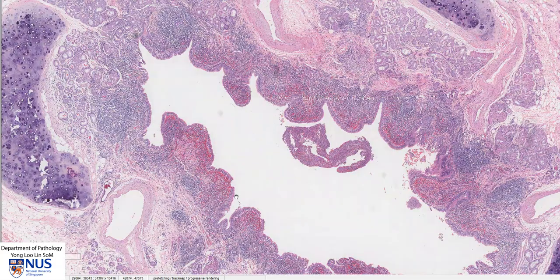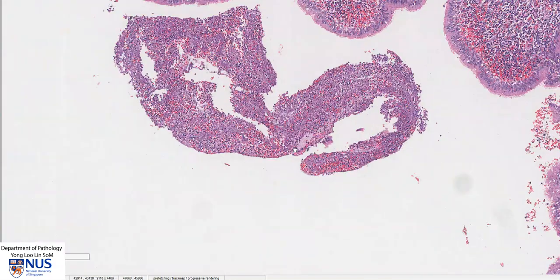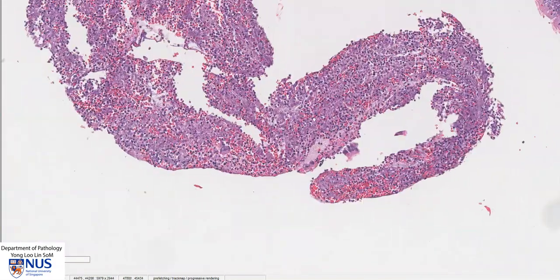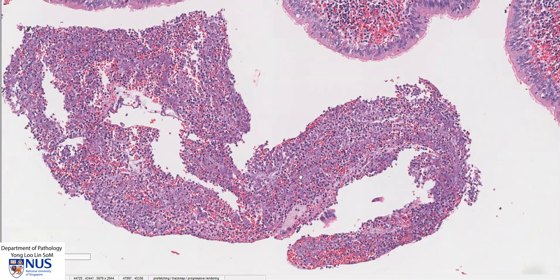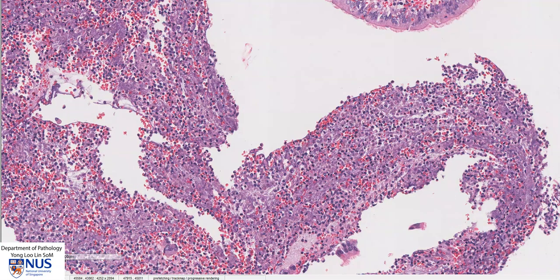Even though the lumen here is mostly empty, in the intact specimen it is often filled with mucus and purulent material. Here we actually have some remnant acute inflammatory exudate with fibrin admixed with neutrophils.